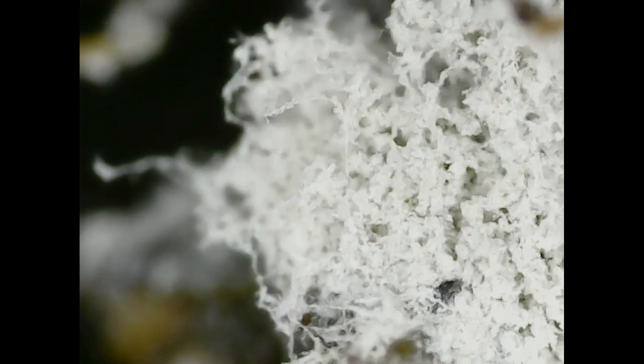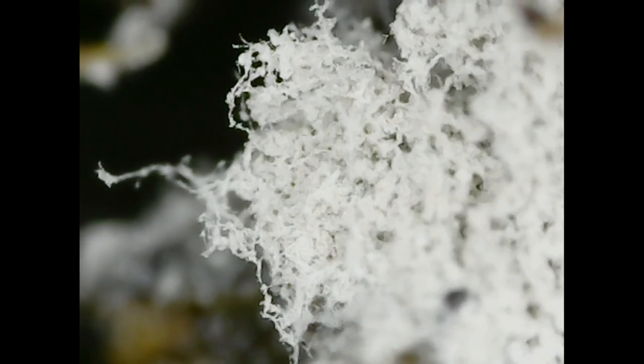Little strings. One of the cool things about fungus is they're closer related to animals than they are to plants. Evolutionarily, they split off animals after the plant-animal split. So they're really weird organisms. This one's breaking down parts of, I think, a kernel of popcorn. I think I busted him up in the scooping, though. Here's a better look at some fungus on a leaf.